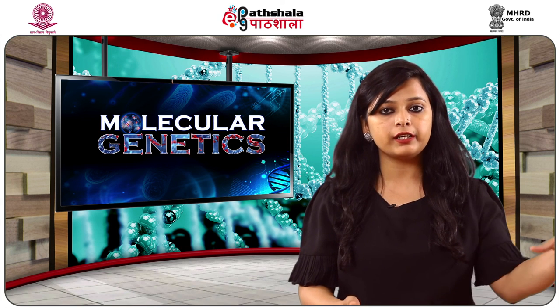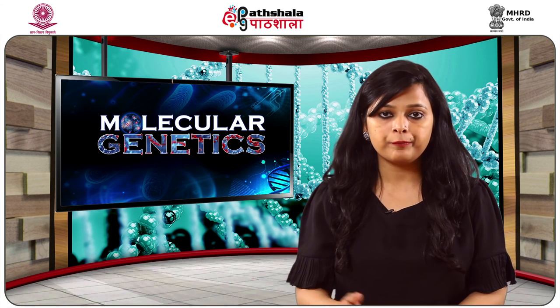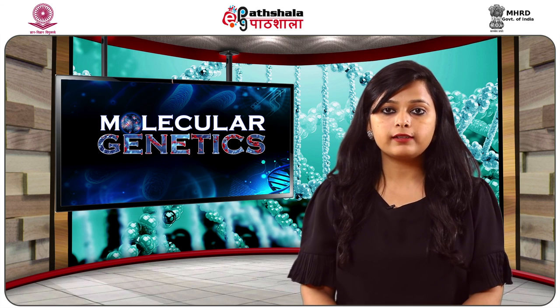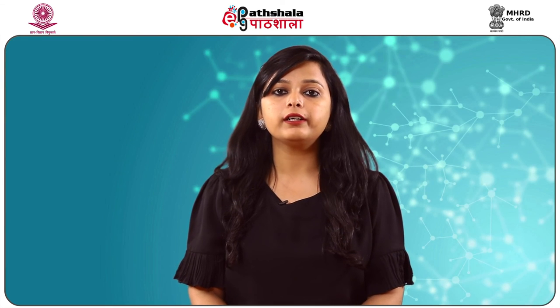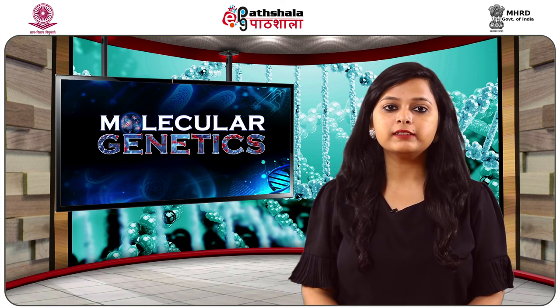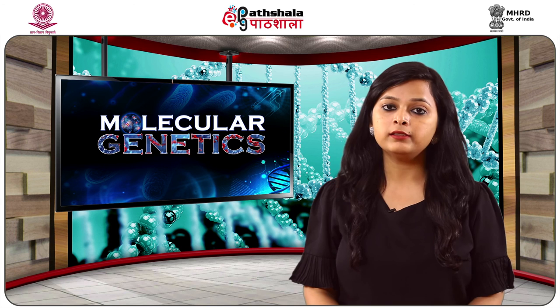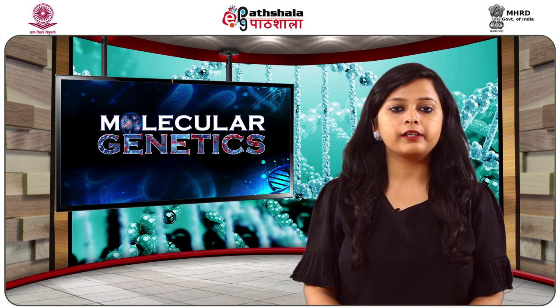Thereafter, the denatured DNA fragments are blotted on a nylon membrane using capillary action or electrophoretically. Further, during hybridization, a probe, a fragment of nucleic acid carrying a specific sequence of the gene of interest, binds to the blotted DNA fragments carrying identical sequences. This hybridization between the sample DNA and probe can be further detected by using a radio-labeled or labeled probe. Southern blot hybridization technique plays a vital role in diagnosis of diseases, selecting genes, genetic mapping, and also DNA fingerprinting.